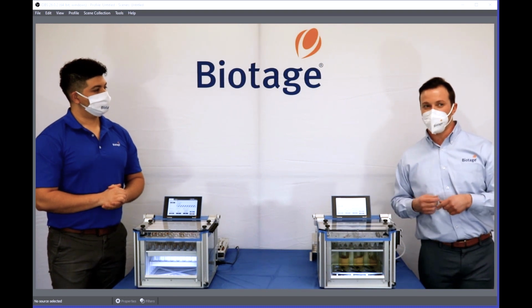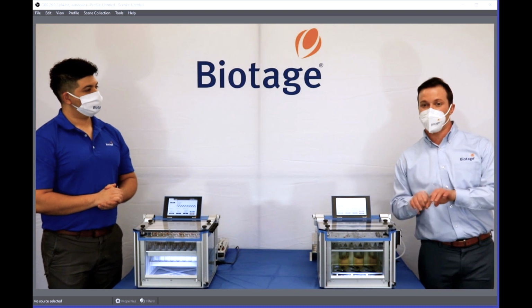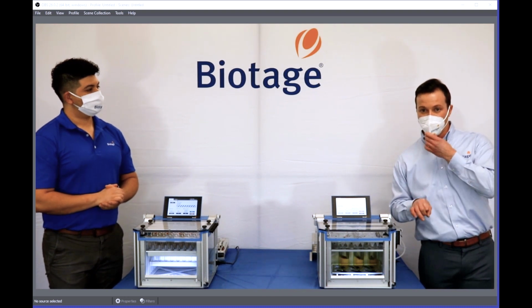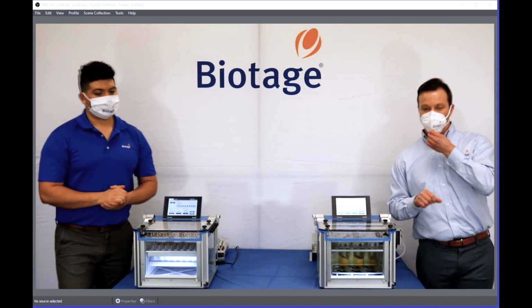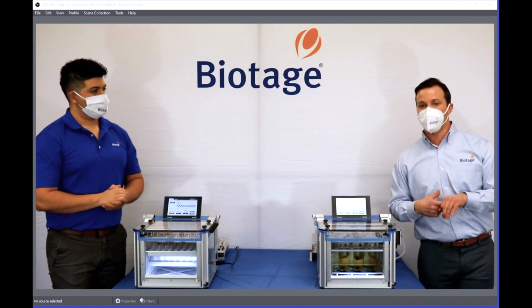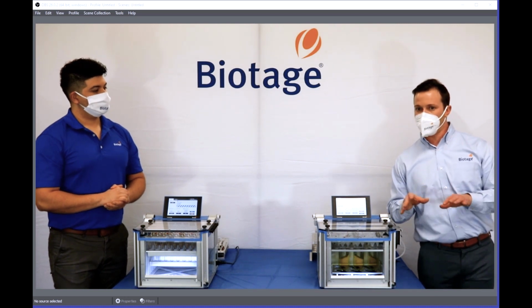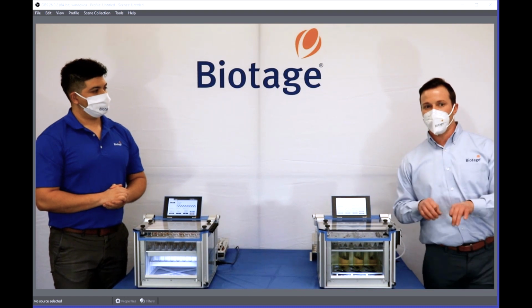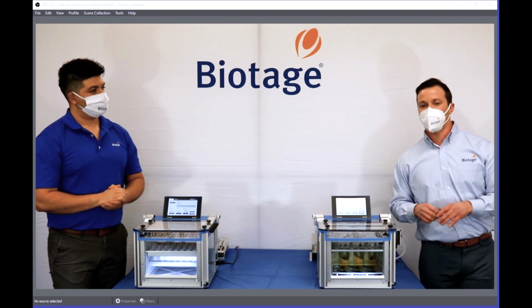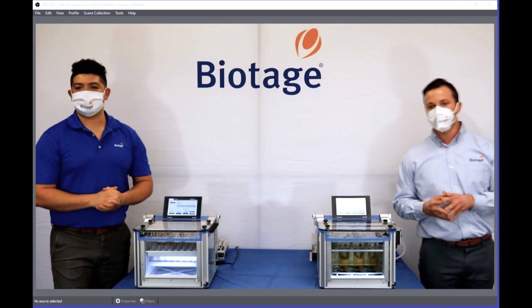So I would suggest using a worm ring clamp around your nitrogen line to kind of tighten it onto whatever you have it on. Maybe it's on a nozzle in your fume hood, or using a quick connect. Quick connects work really well. So I think that's what you're talking about. And if that is, then yeah, I would recommend just giving it a better connection point. And with the quick connects on the new system, that shouldn't be an issue that you run into.